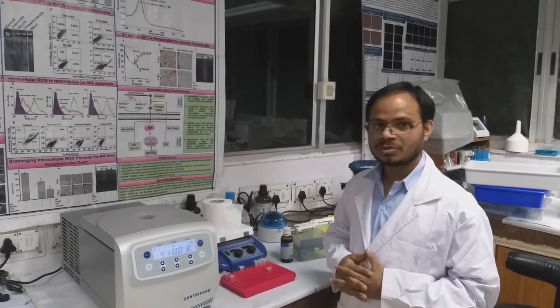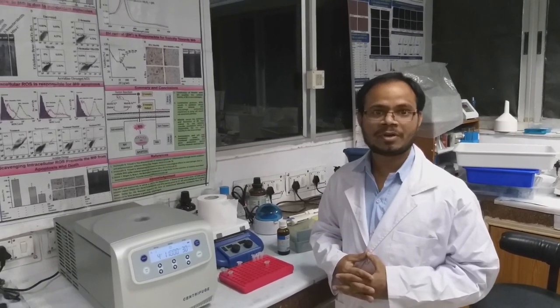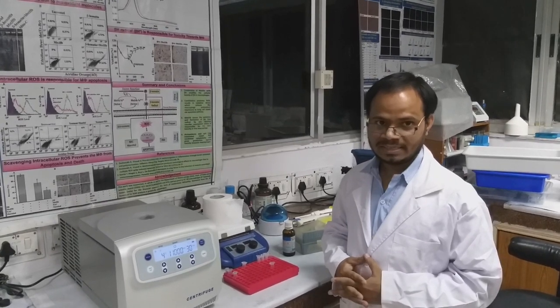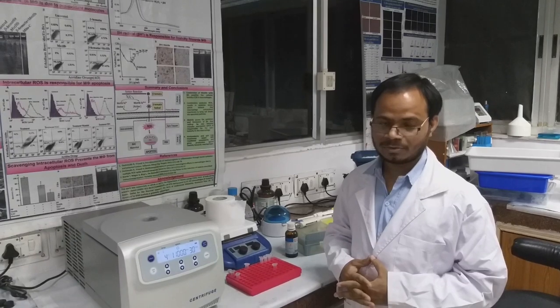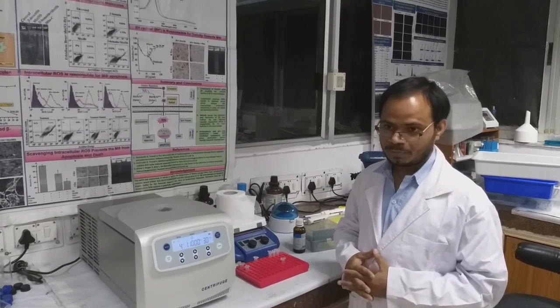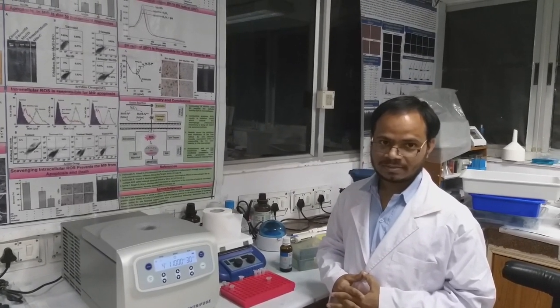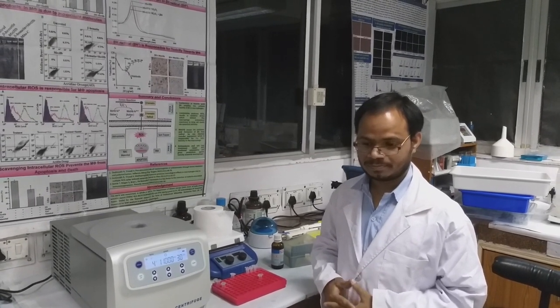During this procedure, we have to remember that if we don't add the proper amount of RNase, then we can see a band which corresponds to RNA in our agarose gels and comes with the plasmid DNA. So post purification also we can add RNase and utilize it for the application.